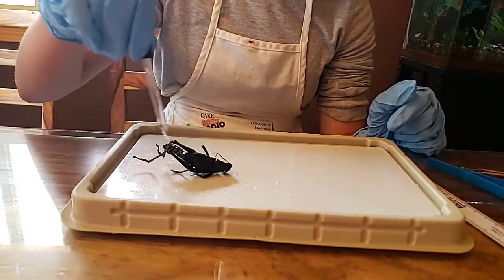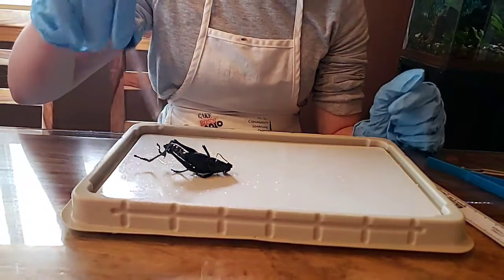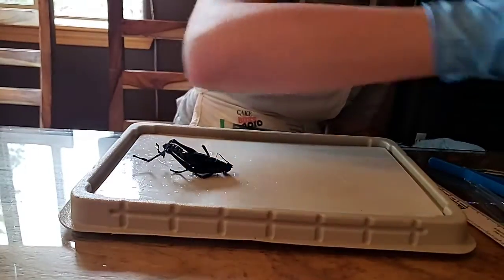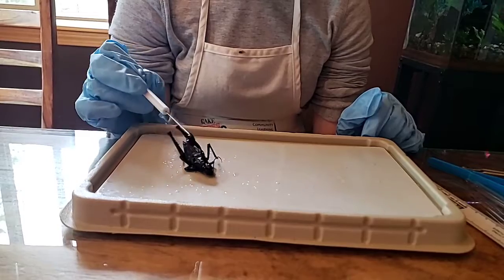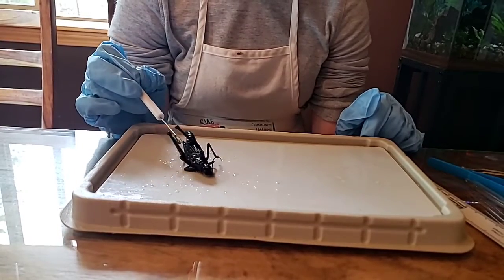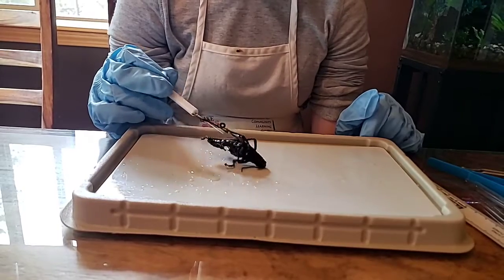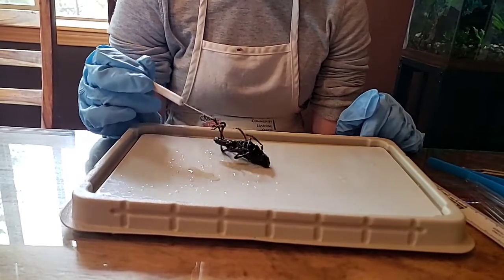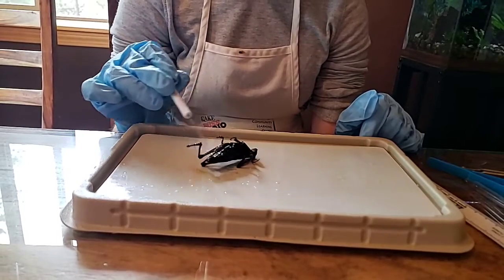All right, so observe the external anatomy of the preserved grasshopper. Members of the class Insecta have three main body regions. What are they, guys? The head. The head. The body. What's another word for the body? Thorax. Thorax. Very good, Lanston. And the back part? The abdomen. Abdomen, similar to that crayfish yesterday. So you've got the head, the thorax, and the abdomen.